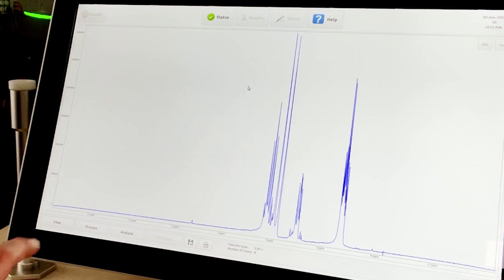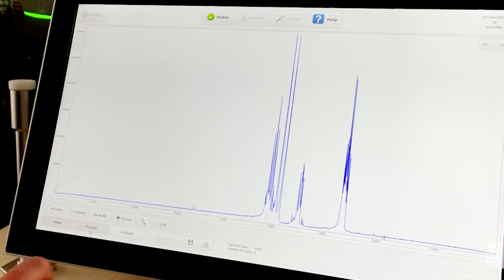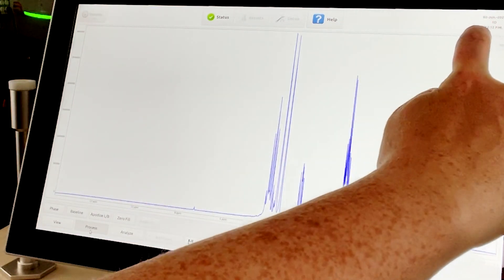Once the acquisition is complete, the user can change their view to observe the FID, for example.